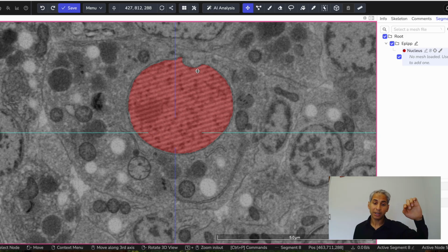Ask other classmates that are also doing your cell type. For example, I'm doing guts. Everyone annotating gut cells, do you see something like this in your cell? Ask around. If nobody else sees it, that's pretty cool. Then you can start to ask, what is this? And why is it happening in my cell? So keep an eye out for these things.